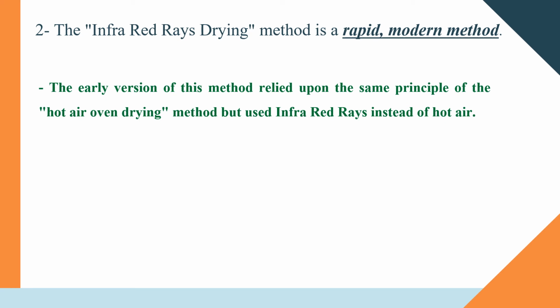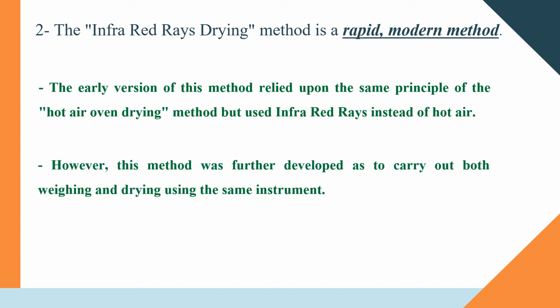But in this case, we use infrared rays instead of hot air for drying the samples. This was an advancement because it shortened the time for doing the analysis from 4 hours to around half an hour. But in fact, there has been another interesting development in this method over the recent years.